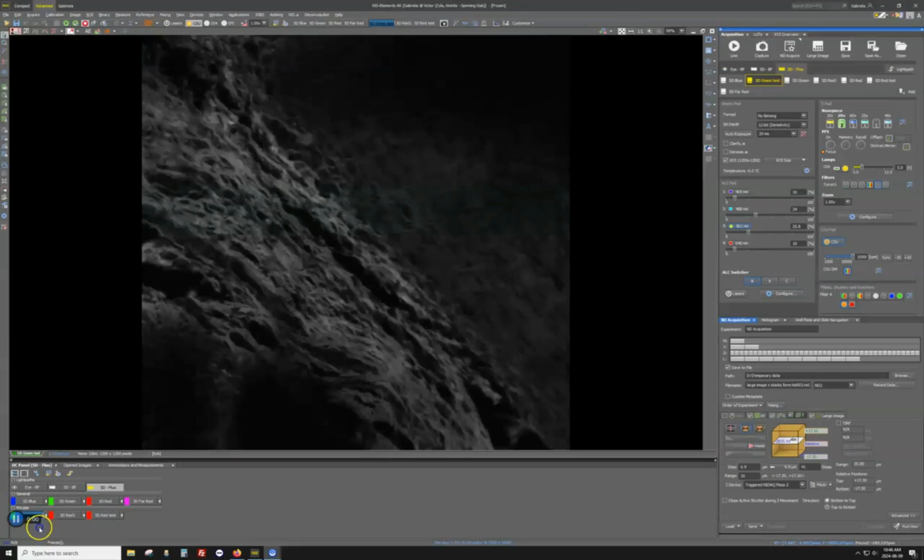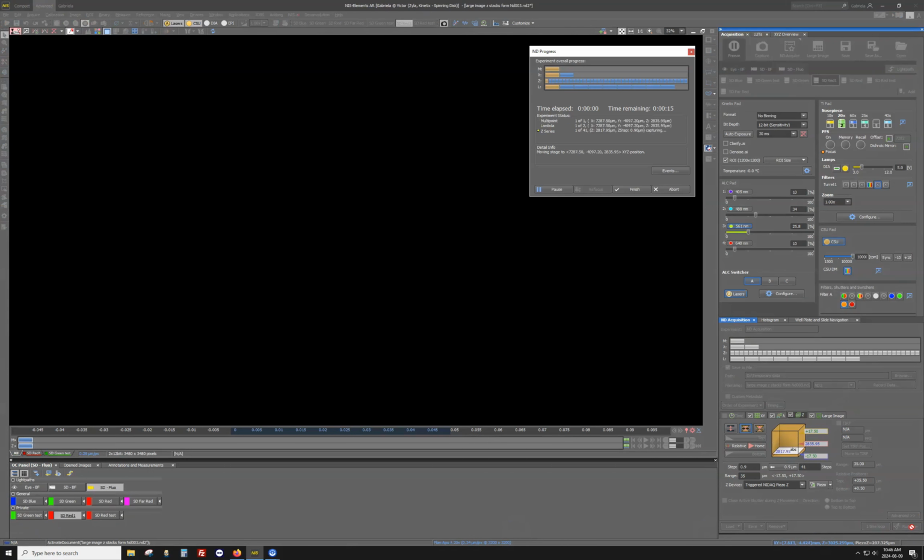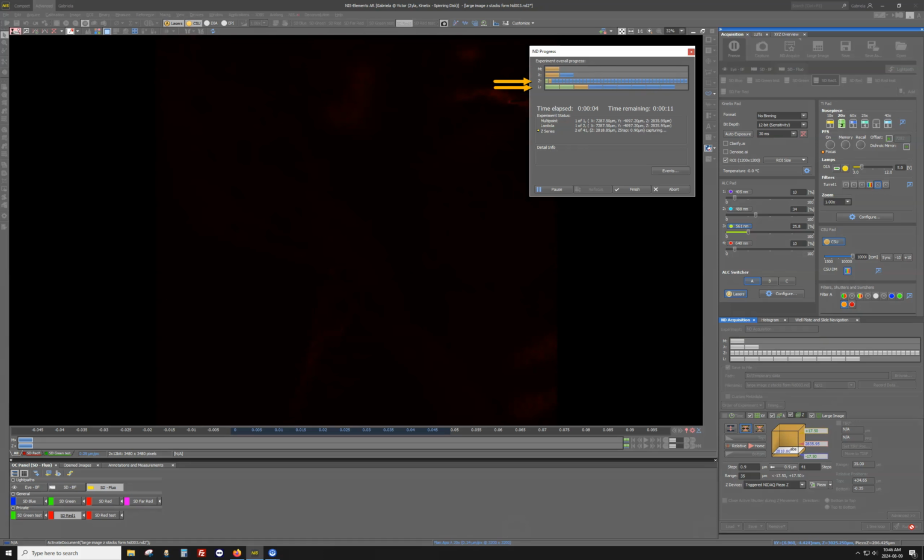You can create large images in different ways. One way is to use the function from the ND Acquisition tab. Let's say that we want to create a tiled image 3 by 3, altogether 9 tiles, with a Z of 35 micrometers with 2 different optical configurations.